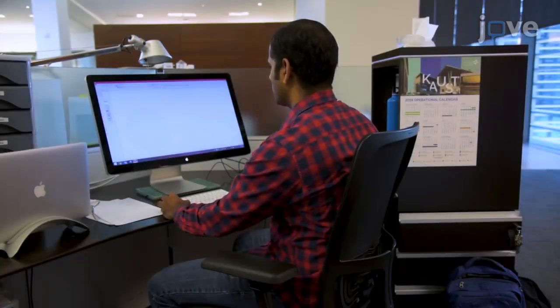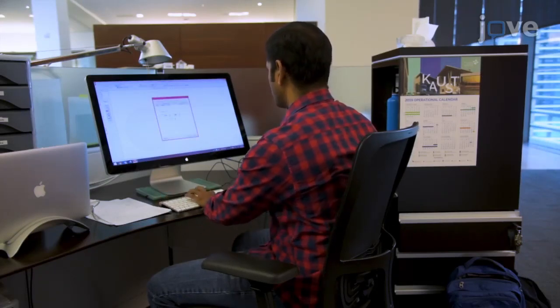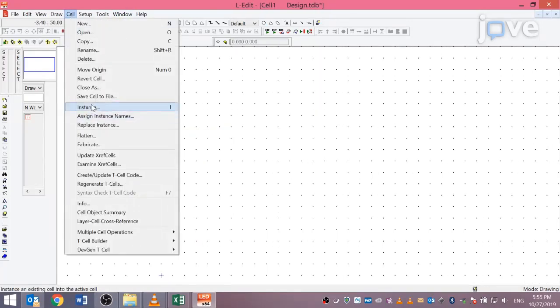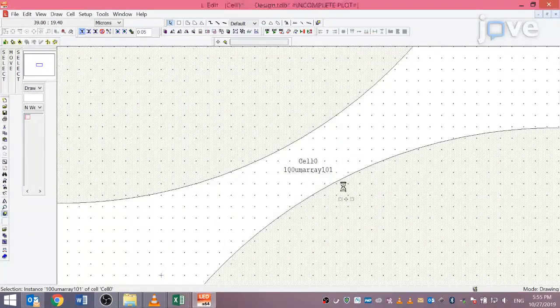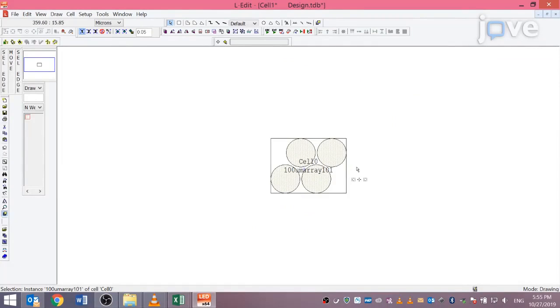Start the microfabrication process by creating a new file in an appropriate layout software program. Draw a unit cell comprising a 200 micrometer diameter circle. Copy-paste this circle with a center-to-center distance of 212 micrometers to create an array of circles in a square patch with a 1 centimeter squared area.